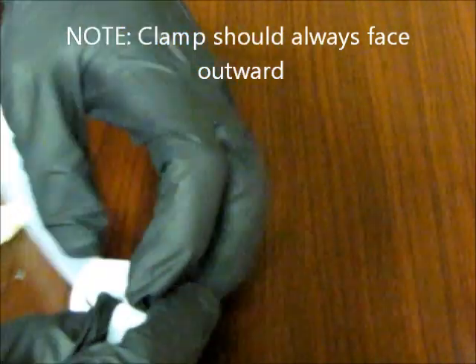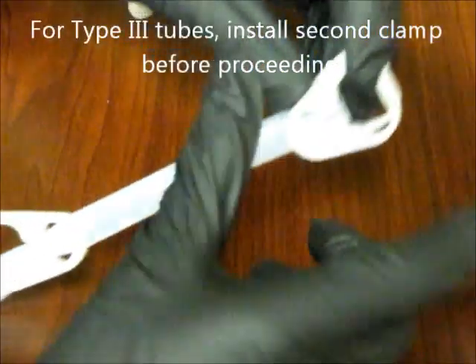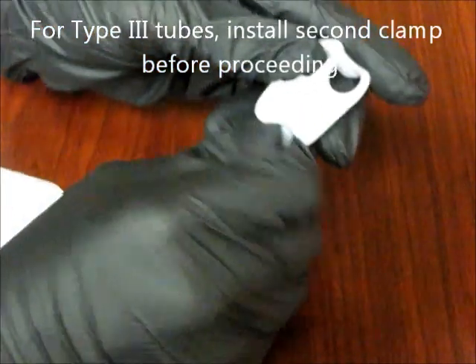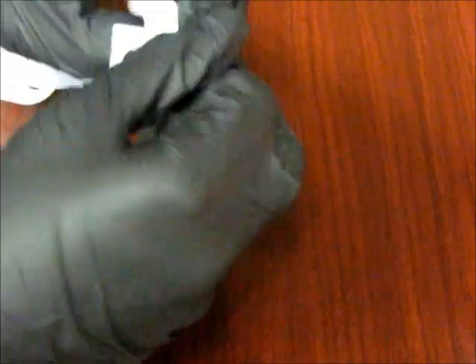For type 3 tubes, install the second clamp using the exact same process before proceeding with the next step in the creation of the tube.